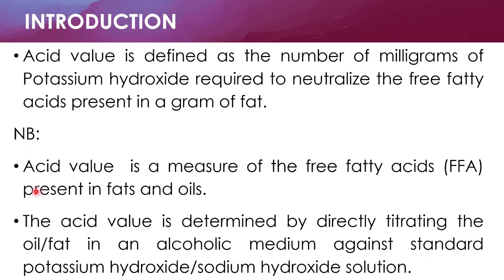When we talk of acid value, it's defined as the number of milligrams of potassium hydroxide required to neutralize the free fatty acid present in a gram of fat. What we also have to note is that acid value is a measure of the free fatty acids present in fats and oil.